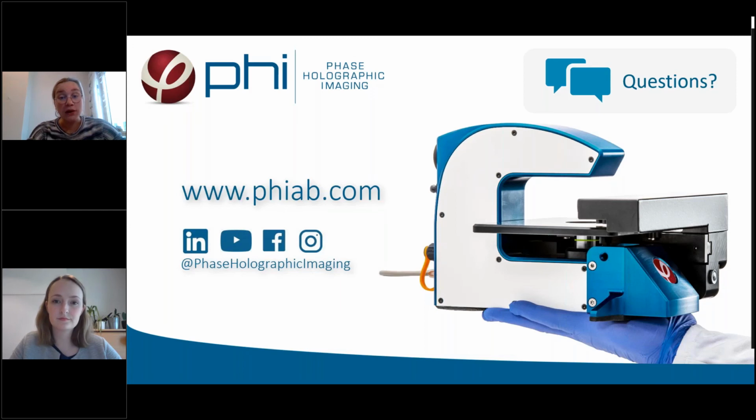And there you can also, if you want to combine, for example, 3 repeats of your experiments, they can be combined here to generate more extensive statistics, for example. So you look for the data in the software, but you can then use it also afterwards for further analysis and statistics. I think that might have been the question, so it's good.